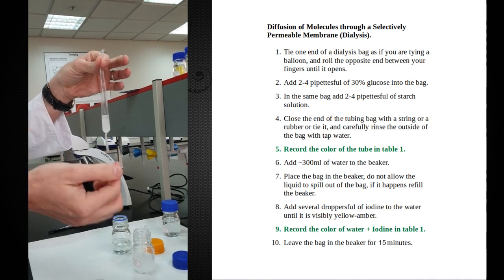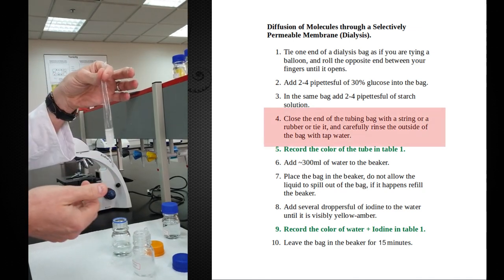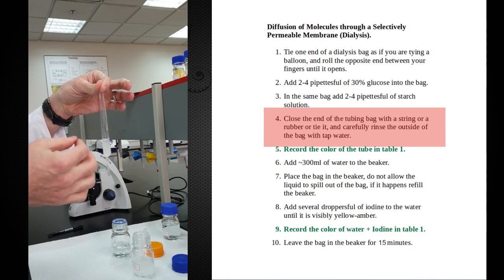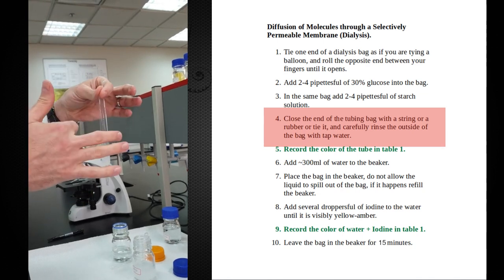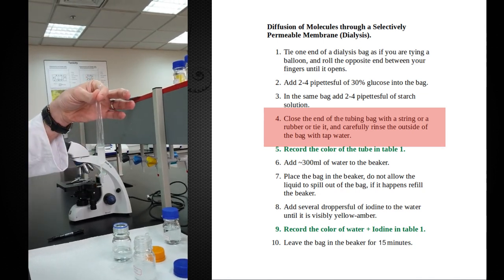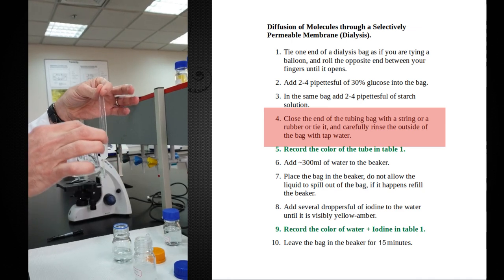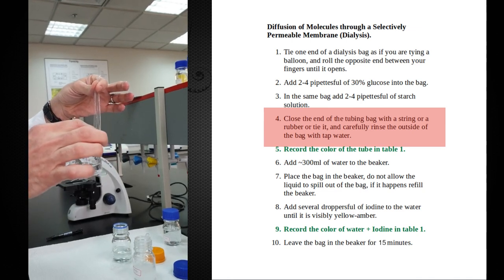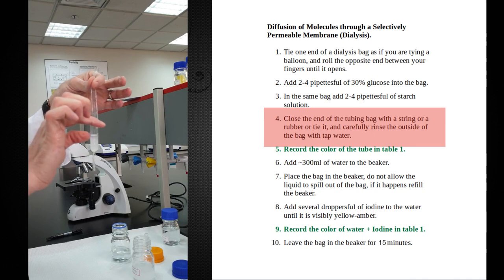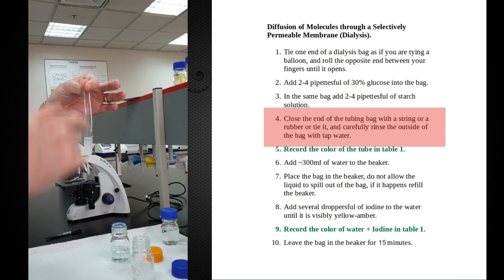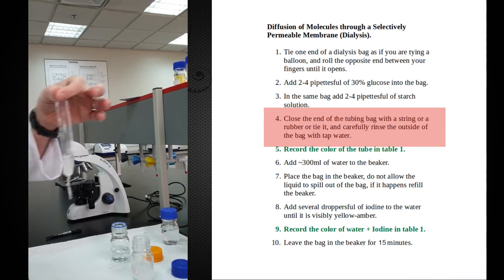I'm not ready to put this into our beaker yet because I might have some residue around the outside. The next thing you want to do is go back to the sink and just rinse off the outside of this thing to make sure that there is no sample on the outside of the bag. If there's any glucose or any starch that goes into this beaker, it's because it went through the dialysis bag and it wasn't just on the outside of the bag. I'm just going to wash this and come right back.